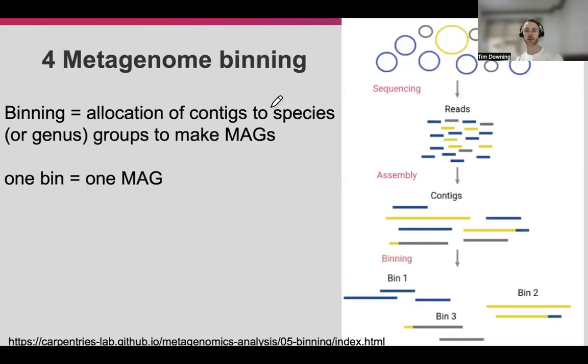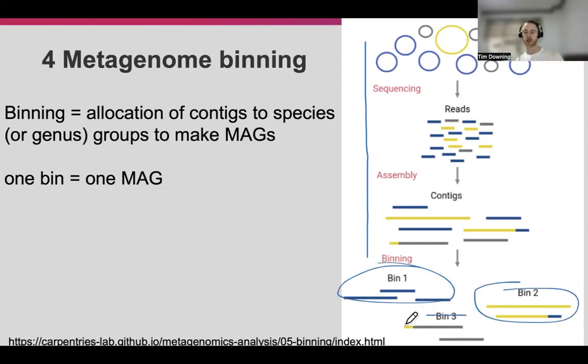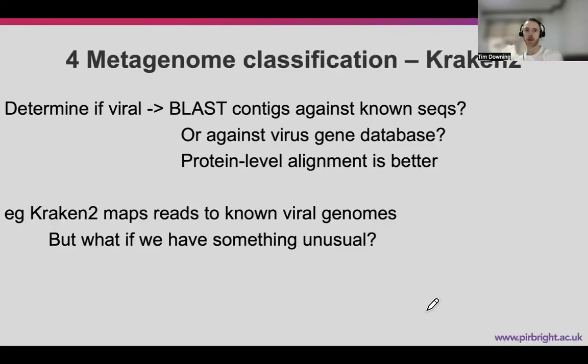This is different from metagenome binning. In that approach, in lab part B, we're doing our sequencing, getting our reads, doing our assembly, and then binning them into different species groups based on the similarity and read depths that we have present. And these bins are all metagenome-assembled genomes. So that's different from what we're doing, where we're using Kraken 2 to tease things apart first.